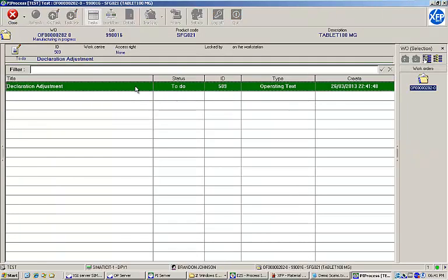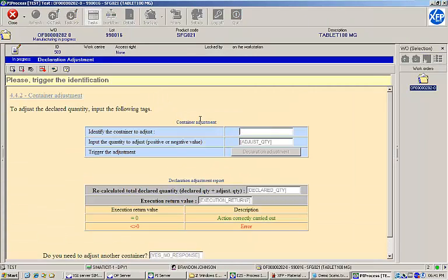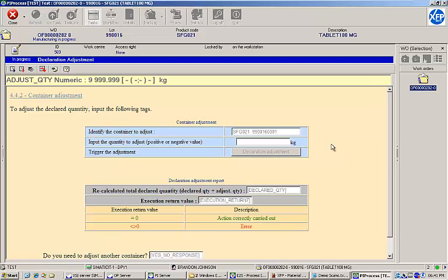From the declaration adjustment task, we can identify one of the containers we just declared by scanning its label. Then we can provide an adjustment value to correct its quantity. Let's subtract two kilograms that we lost during the manufacturing process.